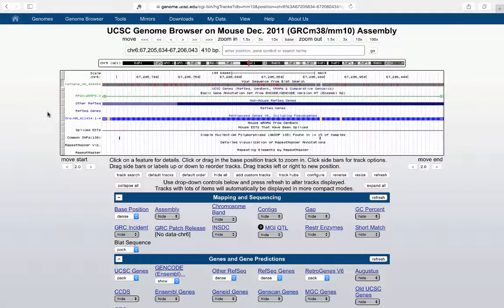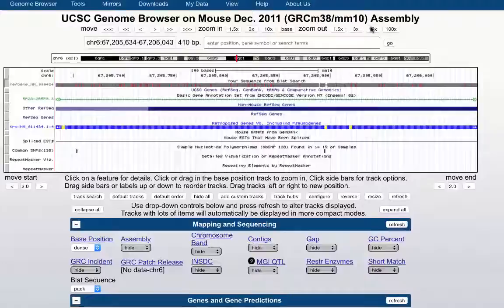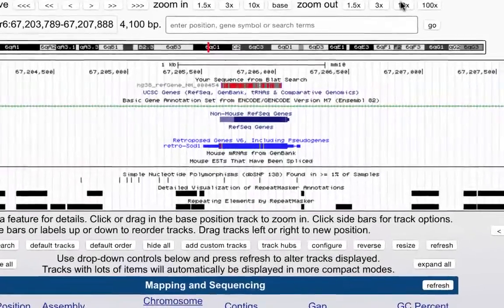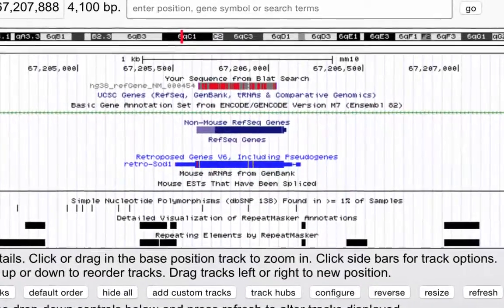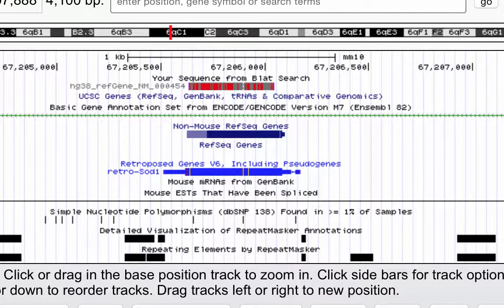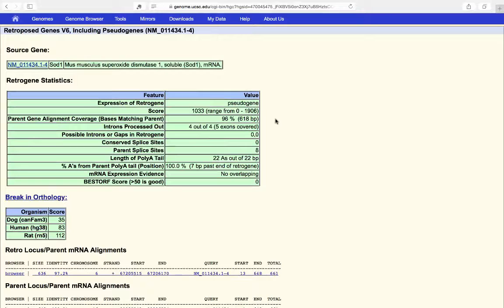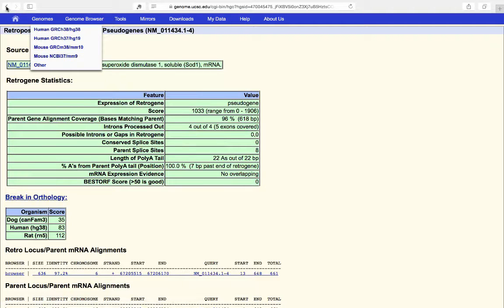Keep in mind this is MM10, a completely different assembly. Zooming out tenfold reveals what's happened: we've found a pseudogene for the SOD1 gene — a retrotransposed version. Clicking through confirms the source gene is Mus musculus superoxide dismutase 1, but this entry is a pseudogene, which explains why the hit is so short.